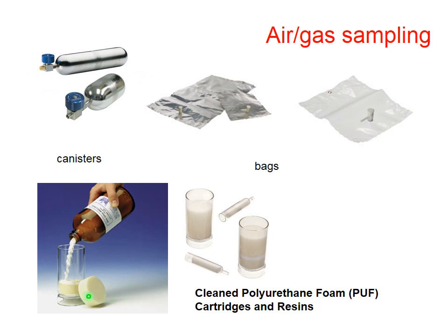The very good idea is to collect it into a cartridge made of polyurethane foam or some resin, and then compounds of interest will be absorbed on this surface, and then you can analyze. You can run such filters through cubic meters of gas and have detectable concentrations of very small amounts.